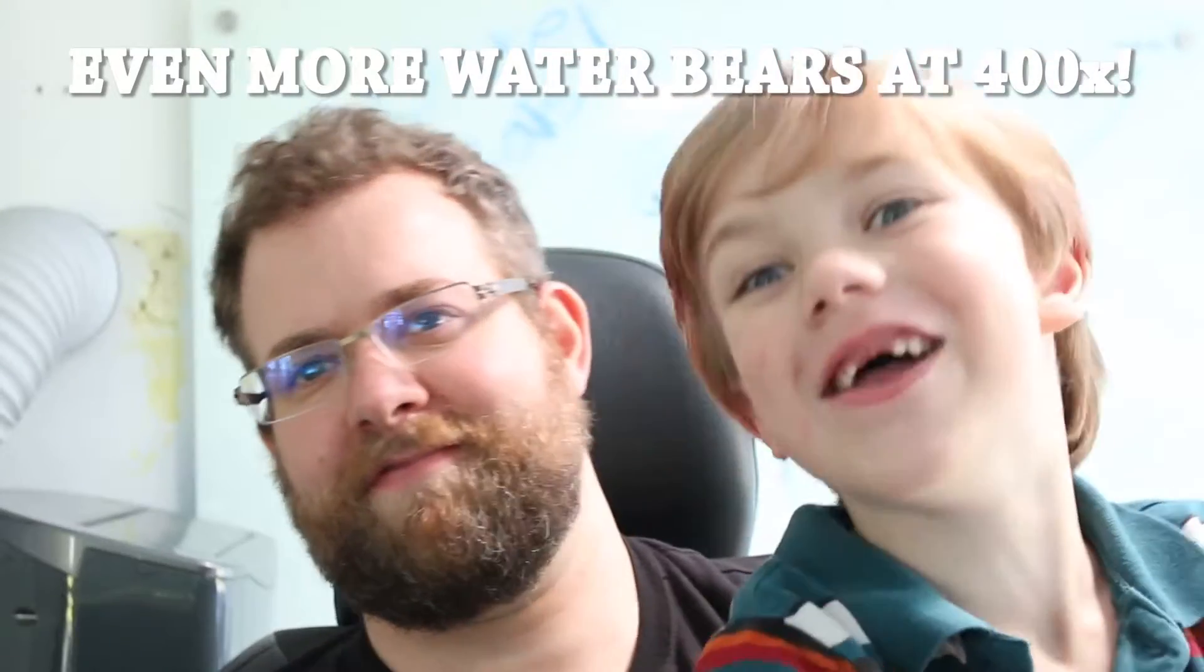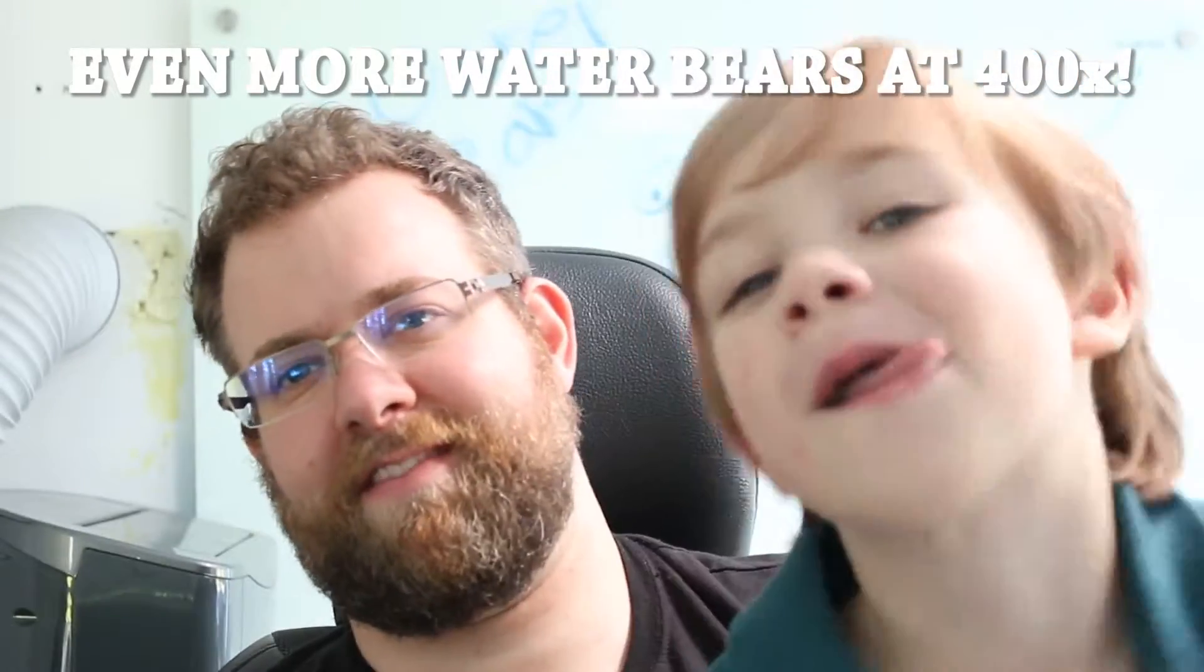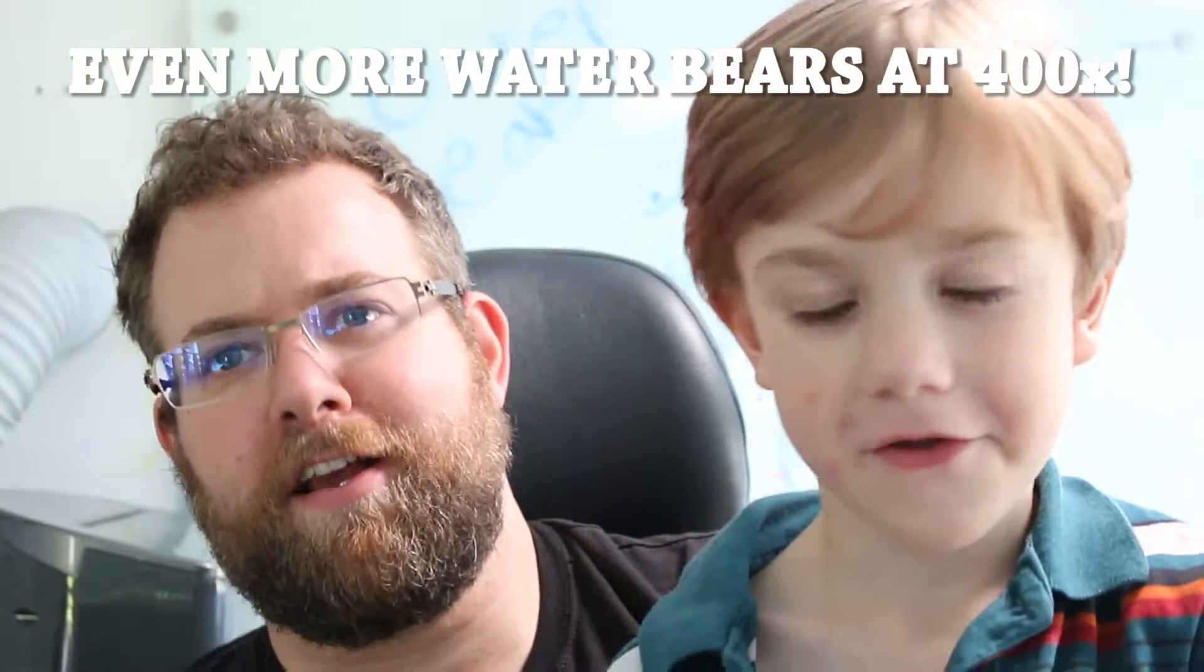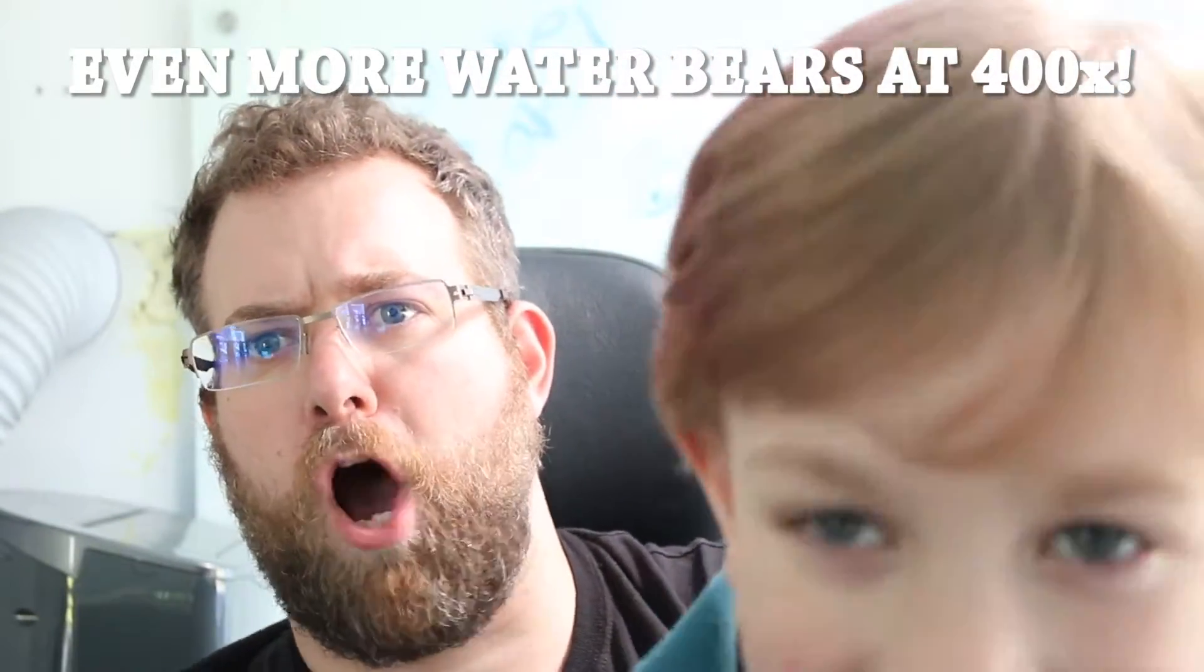Hi, YouTube. I'm Joseph Dottillo. And today we're watching the last installment of Water Bears at 400X Magnification.